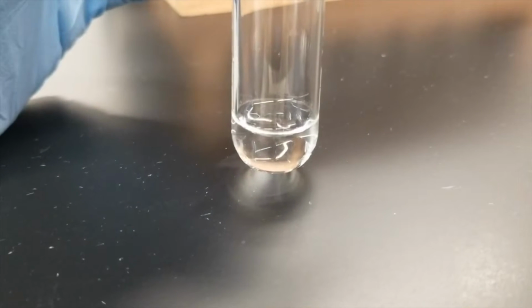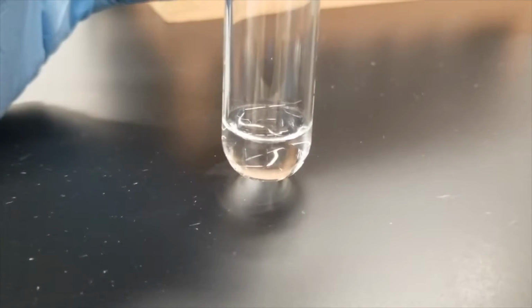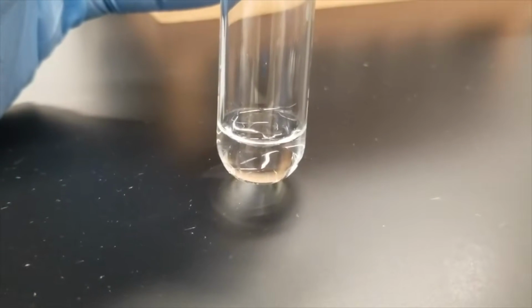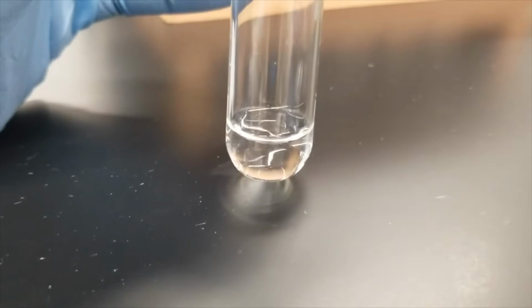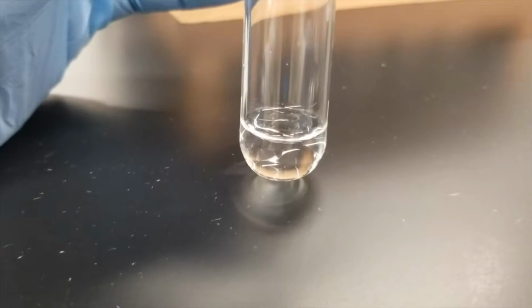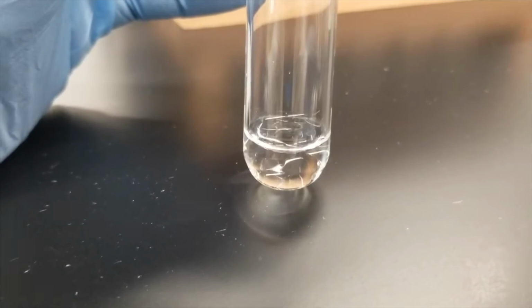Here's a close-up of our reference test tube or standard, just so you can see the lack of evidence of decomposition here, showing how slow this uncatalyzed reaction is. You can't really see any bubbles right now. So again, this is a good comparison for whether or not we have a catalyzed reaction. You'll see that when we do have a catalyzed reaction, there'll be a pretty stark difference in the number of bubbles and the speed at which they appear.